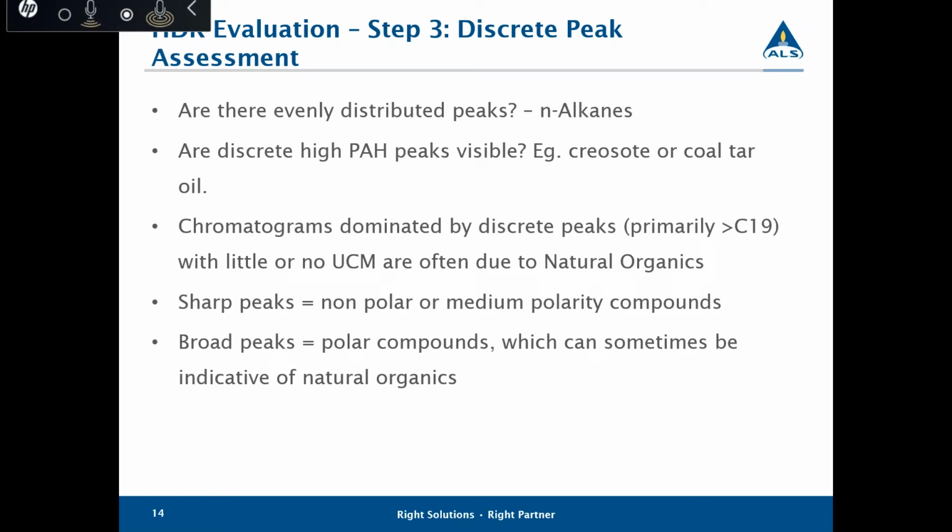In those cases, we can use GCMS characterization to try to identify large discrete peaks. For example, if the PAHs are present and they dominate the chromatogram, this may be an indication of creosote. Creosotes usually contain up to 70 to 80% of non-alkylated PAHs. So to actually confirm the presence of PAHs, we recommend GCMS analysis. This is something to remember.